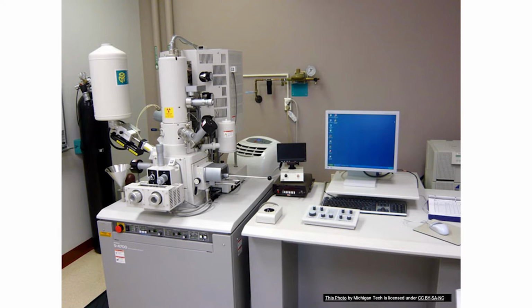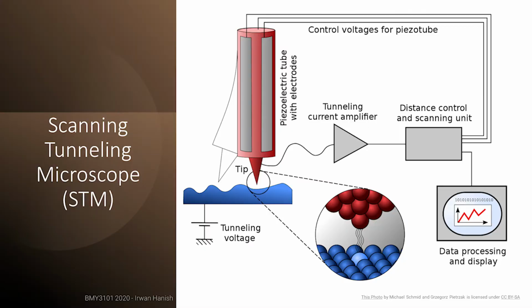Remember, in the last episode, you learned that your compound microscope can magnify stuff 1000 times, like 1000x. So that's good already. But electron microscopes can magnify things hundreds of thousands of times, even millions of times. It's just, subhanallah, it's crazy.